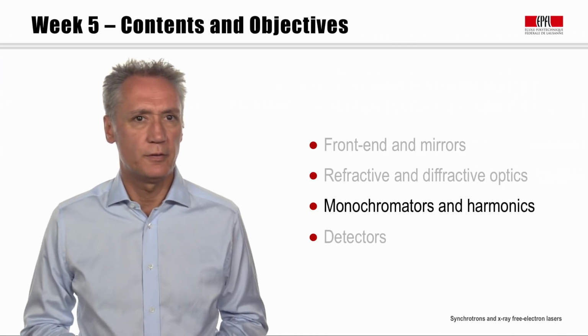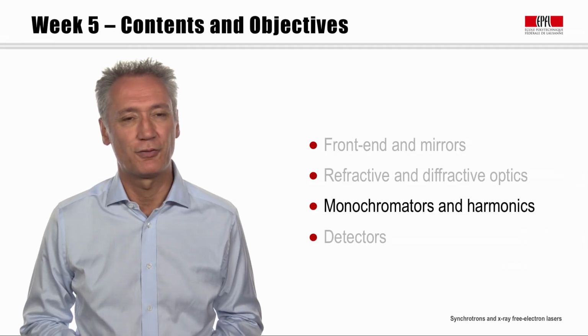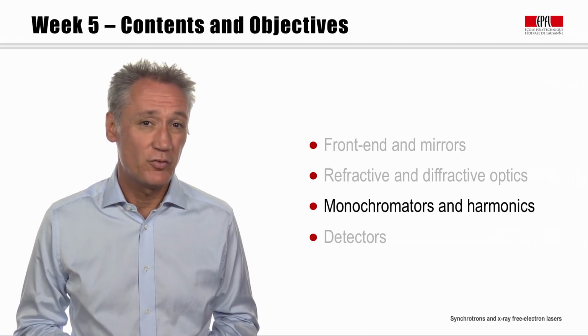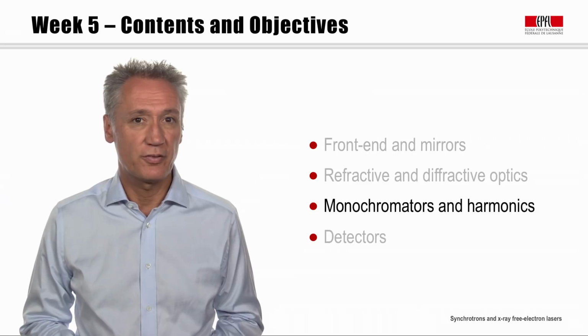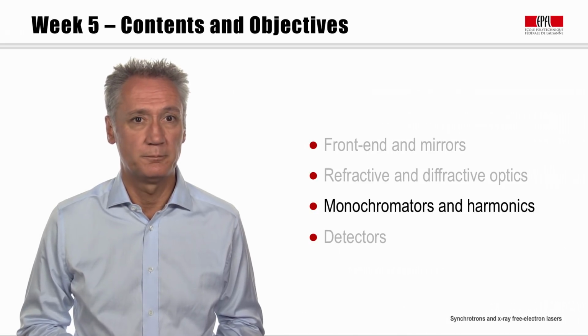Welcome to the second video of week 5 of this introductory course on synchrotrons and X-ray free electron lasers. Now in this video we will familiarise ourselves with monochromators and the handling of harmonic signal.